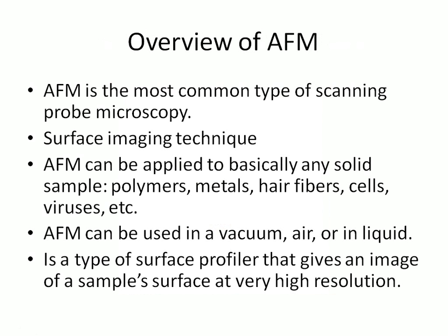Scanning probe microscopy refers to a group of imaging techniques that capture an image of a sample surface. The atomic force microscopy technique is the most commonly used scanning probe microscopy technique. It's used all over the world, and it's used for pretty much any skill level, from undergrad all the way to researchers.